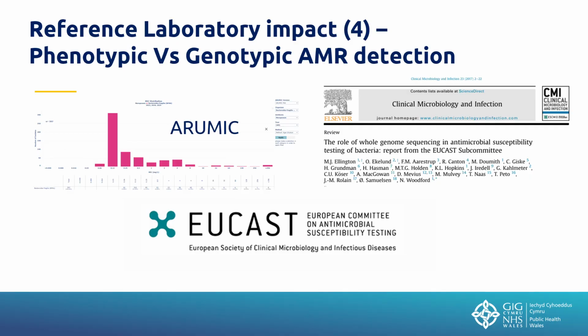The fourth major impact on reference laboratory microbiology for anaerobes is the comparison of phenotypic and genotypic antimicrobial resistance detection, and we're not quite there yet in terms of really saying we can replace phenotypic with genotypic methods, but it's something that we're continually looking at.